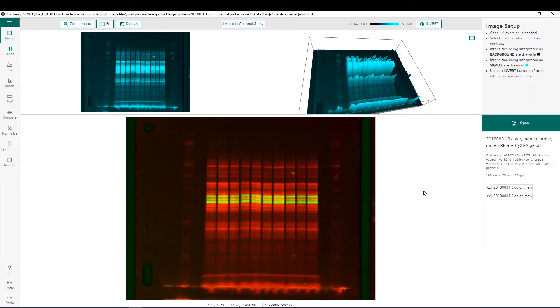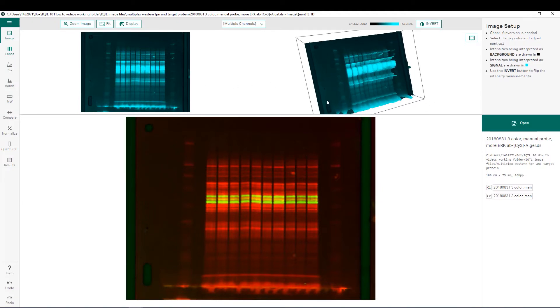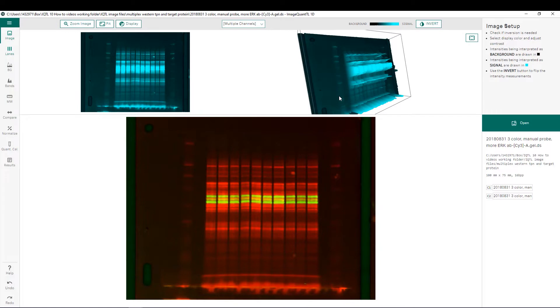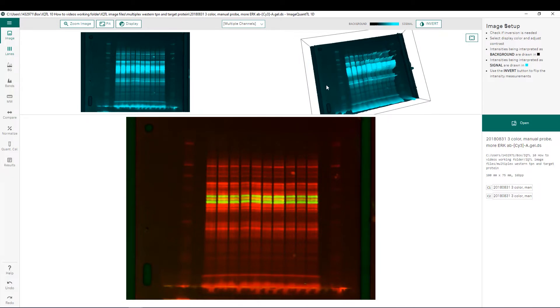Now that we have our image adjusted appropriately, we can see the different displays available to us. We have the 2D rendering in the top left, which shows image quality — any saturation would be shown with orange pixels. There is no saturation in this image, so it is ideal for quantitation. To the right, we have the 3D rendering, which we can rotate to any orientation. If you'd like to save any of these images, simply right-click and choose to save. Below this, we have the multiplex image displaying the different channels and their respective signals.